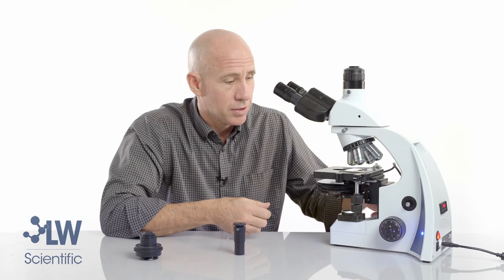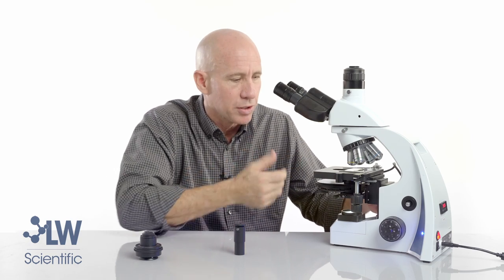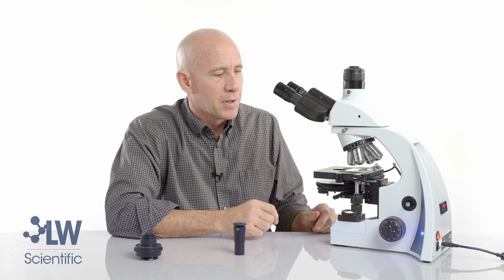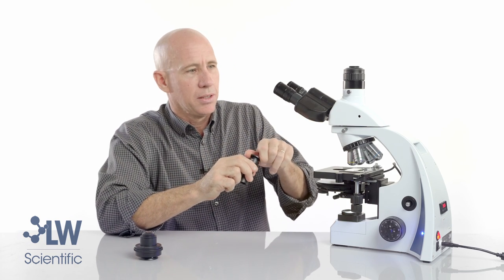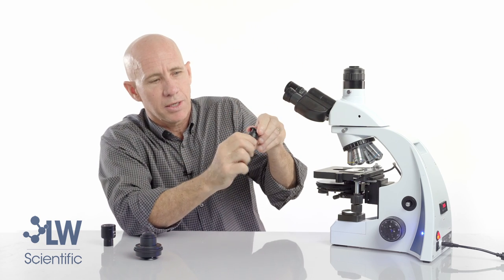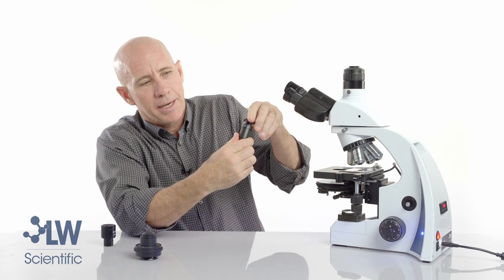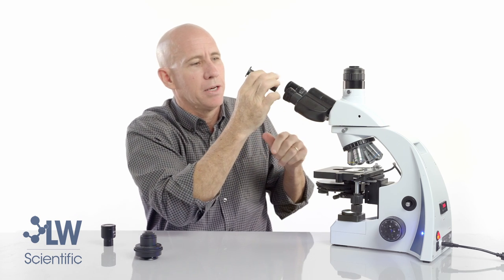It's always important in phase contrast — not only for the alignment process but the whole time you're using phase contrast — that the condenser should be all the way up, almost touching the bottom of the slide. Next we'll use our centering eyepiece. We will pull out a regular eyepiece and use this for the alignment process.